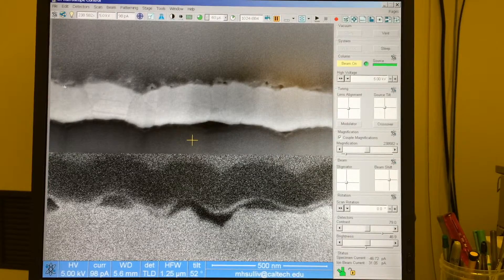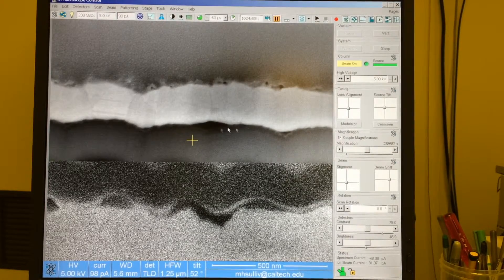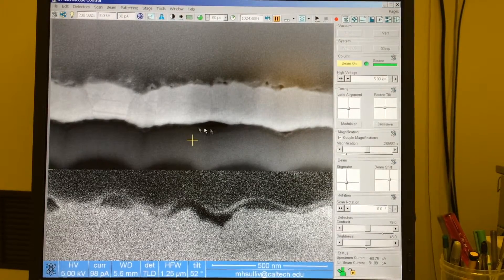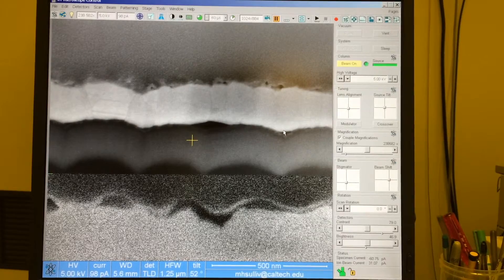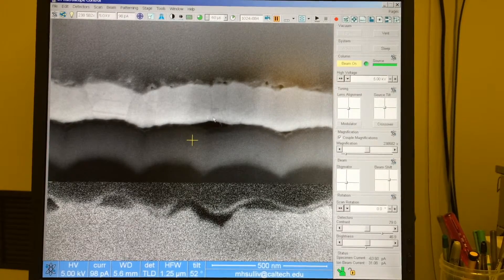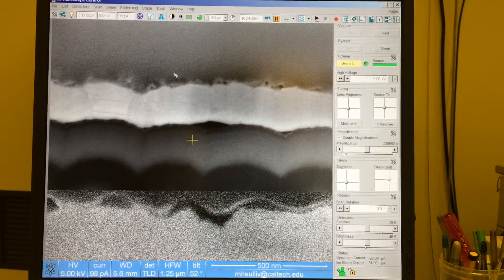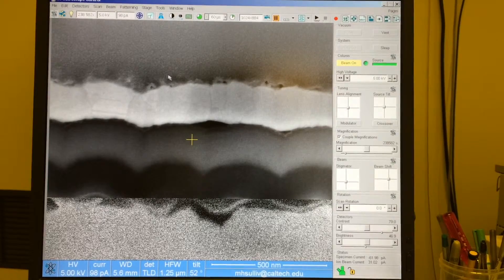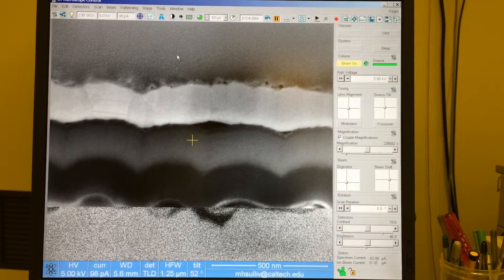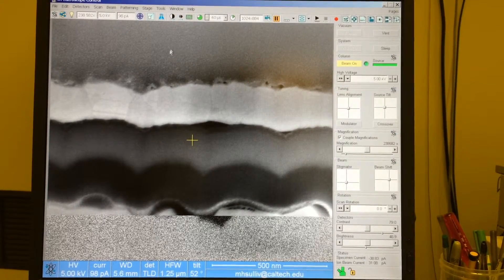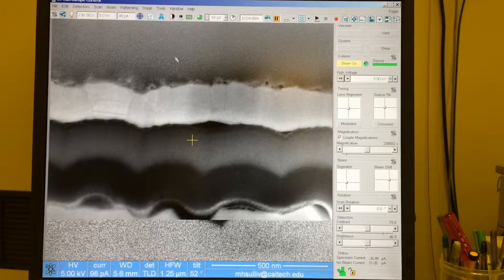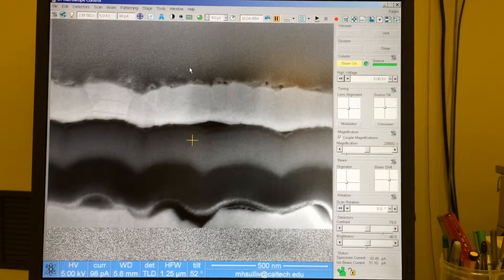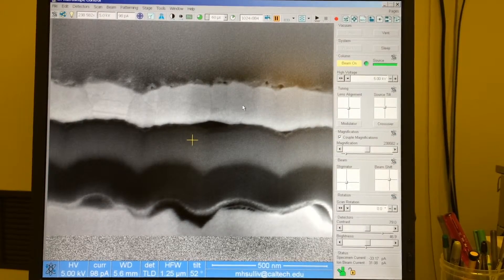Sometimes if your layers are perfectly flat, you have perfectly flat interfaces, you don't have pores or any rough edges to use for your alignment. You can actually just put the reduced window around the electron beam deposited platinum, and you can do the alignment rectangle technique on that, and that's a good way to get to essentially a perfect alignment.